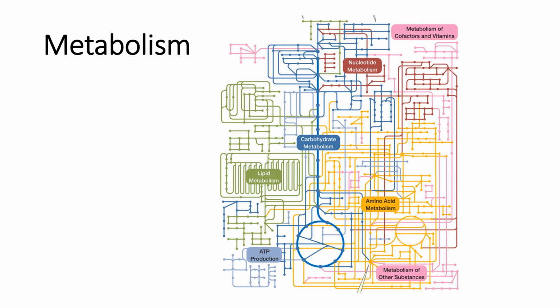Metabolism is defined as all the biochemical reactions that occur in a cell. Bacterial cells, like all cells, are constantly performing biochemical reactions, anabolic reactions and catabolic reactions. For an enzyme profile or a biochemical profile, what we are trying to determine are what reactions a particular type of bacteria can perform.